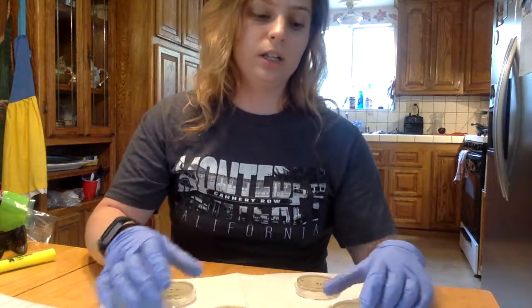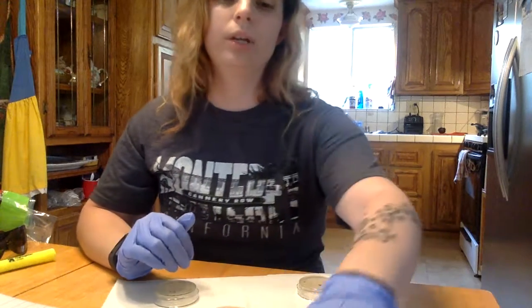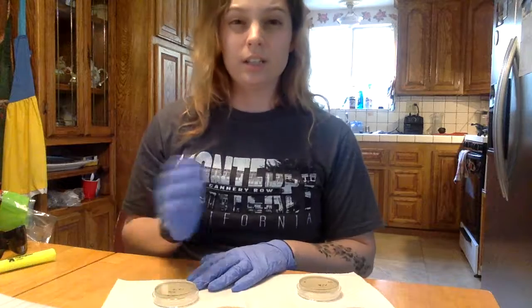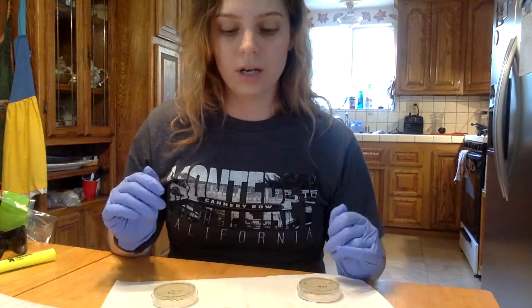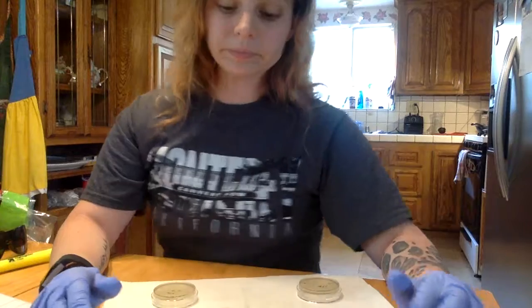So when I calculated the CFU, I calculated the smallest growth number, which was on plate number 5. I didn't think it really mattered at this point because each one of them had such small growth, and that was about 6 million CFUs per milliliter.